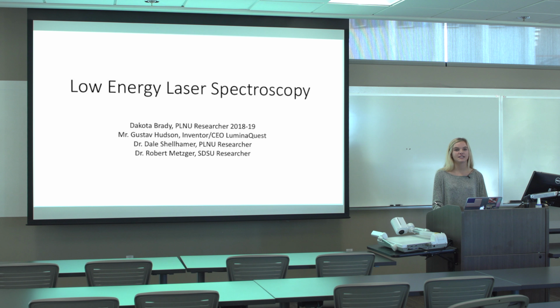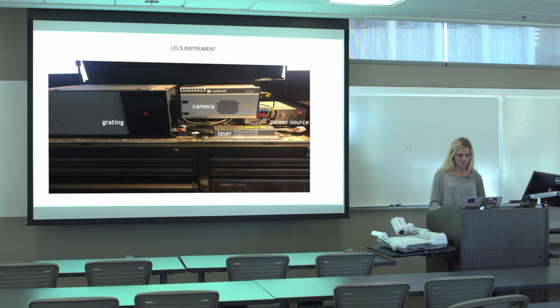I'm Dakota Brady, and this summer I am doing chemistry research with Dr. Shellhammer and Mr. Hudson. Our project is with low energy laser spectroscopy, a type of laser that Mr. Hudson has engineered to function a certain way, and it's similar to Raman spectroscopy.